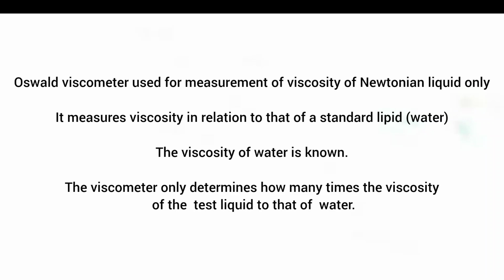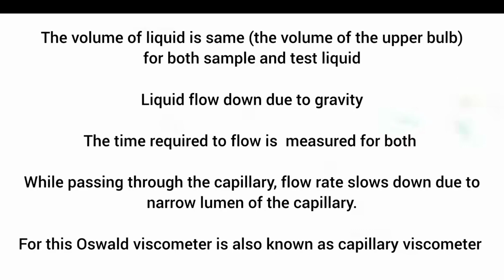Ostwald viscometer basically measures the time of flow for a certain volume of liquid to pass through the capillary. It measures relative viscosity, that is, the viscosity in comparison to a standard fluid, which is water. The driving force of flow is gravity.